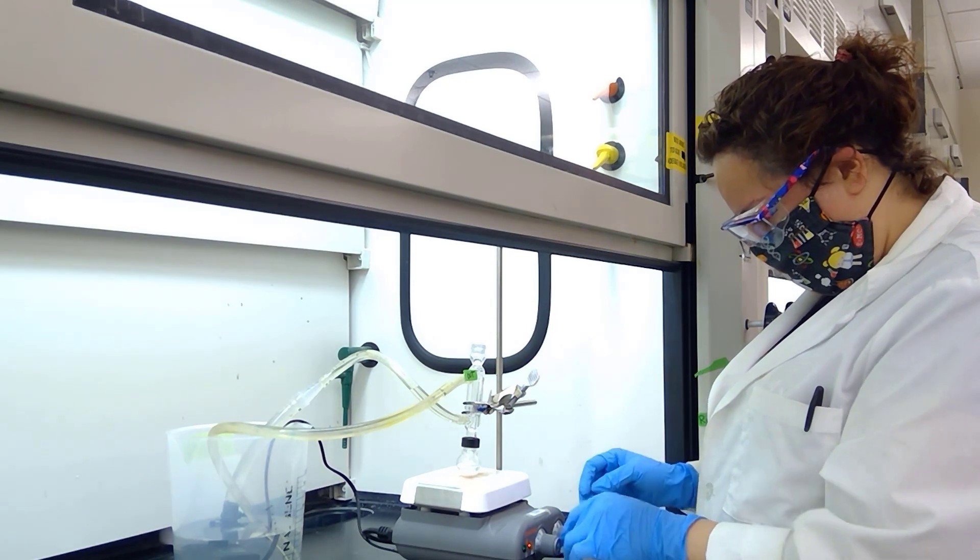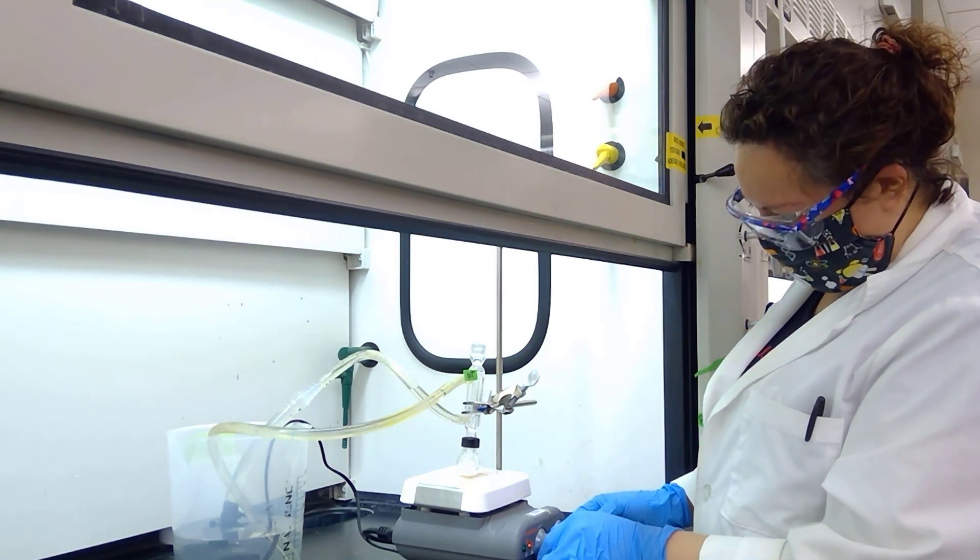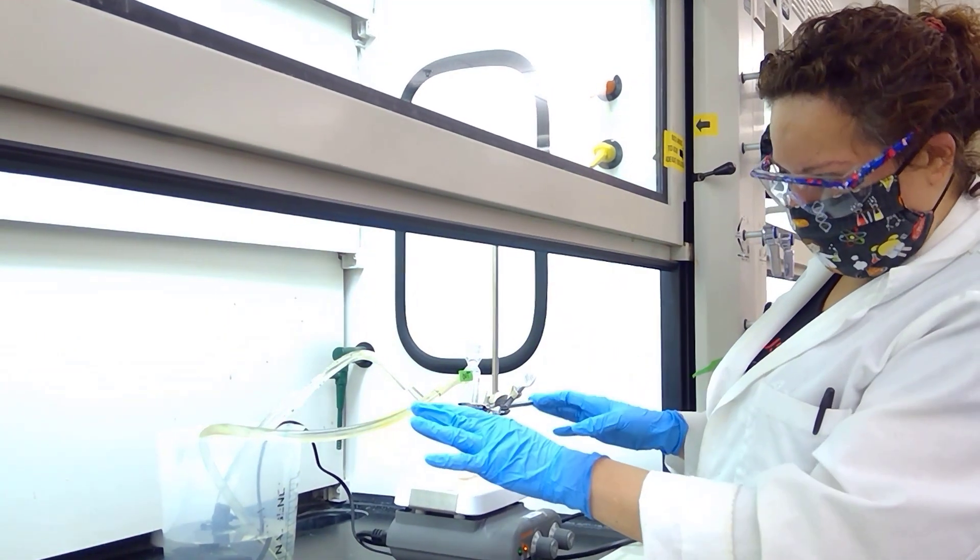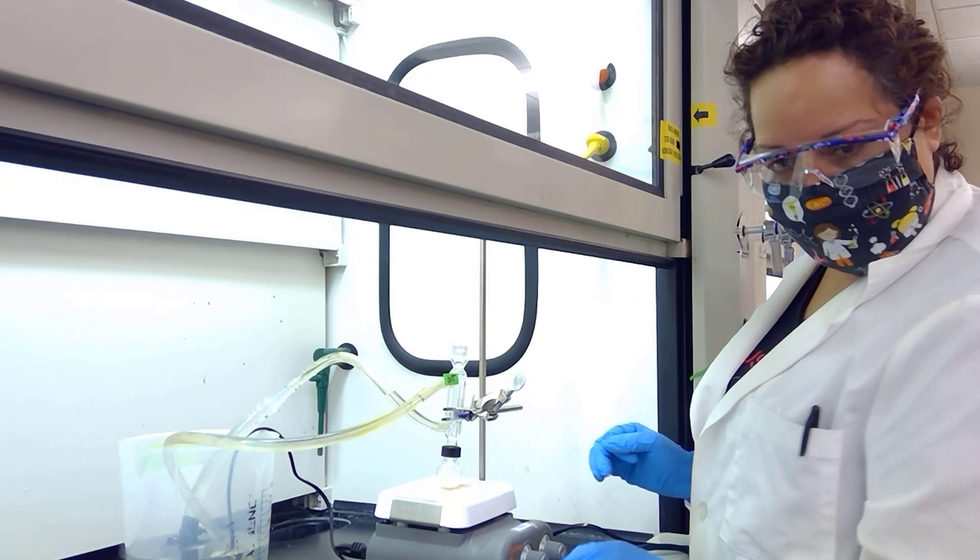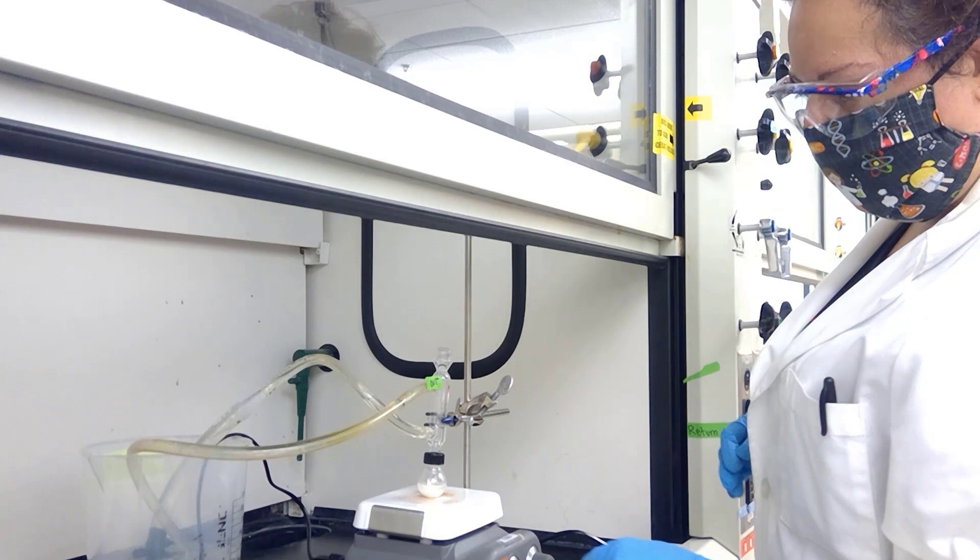We do want the round bottom flask to touch the hot plate here, and we'll adjust the heat slightly so that we can start to get a reflux and some stirring. Also if you notice, my water jacket is set up to a pump system. We will have water come in from the bottom to provide some nice cooling for our reflux, and then it will drain to the top.